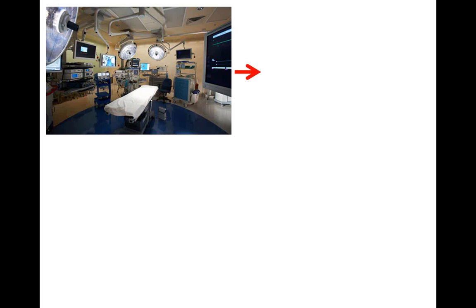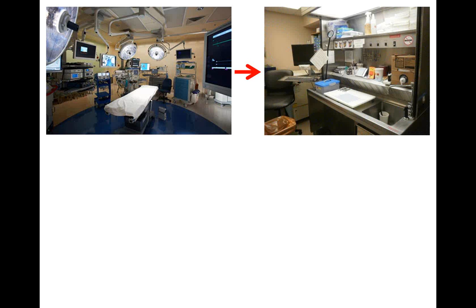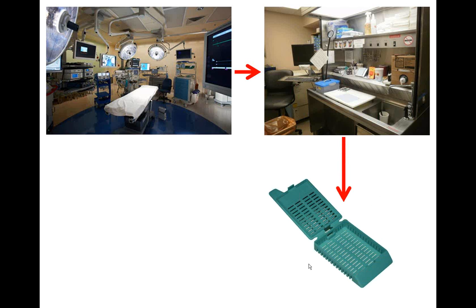From there, though, what happens to the tissue after it's taken out of an operating room is a bit of a black box. Even to clinicians and nurses, they might not necessarily be fully aware of everything that has to go on behind the scenes. The tissue is taken out of the patient from the OR and is couriered over to a laboratory called the Surgical Pathology Lab. This is also known as a gross lab, where the tissue is physically handled and studied and processed, and little samples of the tissue will be put into these little cassettes.